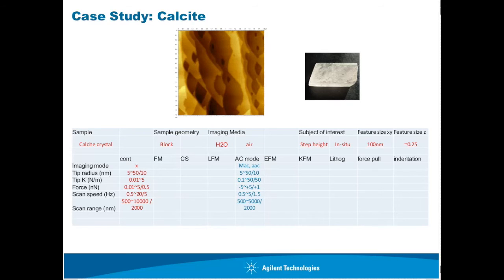AC mode can also work, but I put a little blue here, and that's because AC mode goes a little bit slow, and it actually does not remove any contaminations. It does not give you any advantages, so I put a little blue color here.